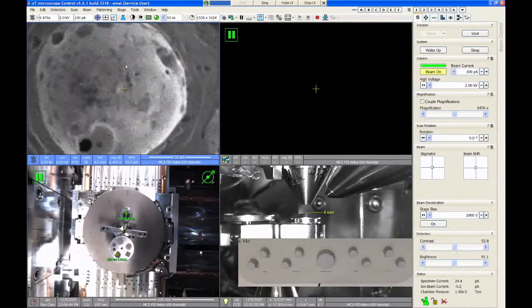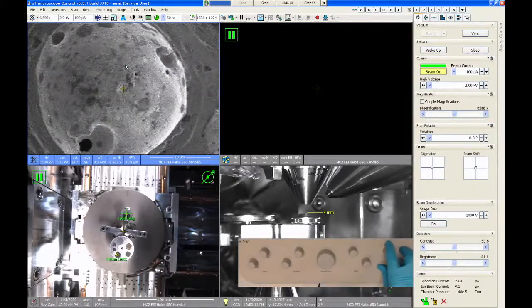But if you're just using the SEM as a quick check while you're doing like a FIB cut, you may not care about resolution. You may just get the focus and astigmatism fixed, and it's good enough. So I'm going to leave that decision up to you. But again, I'm going to show you how to really tune up the SEM for best quality if you need it.